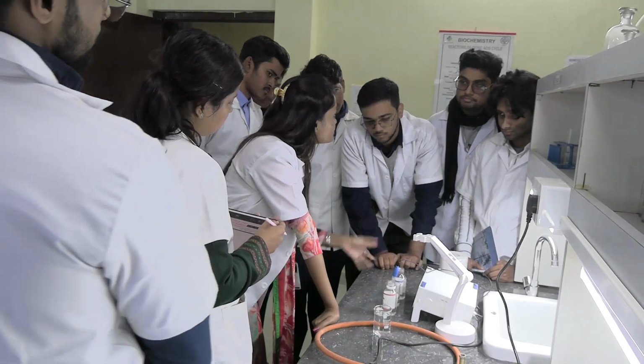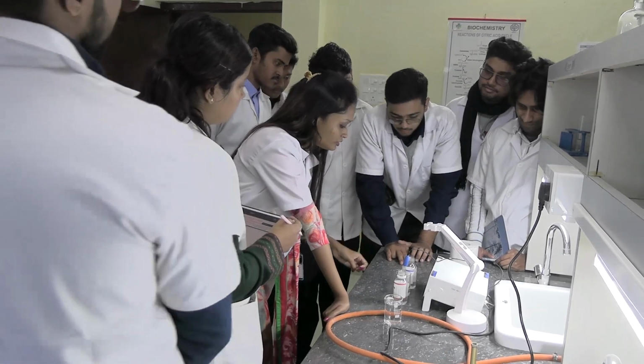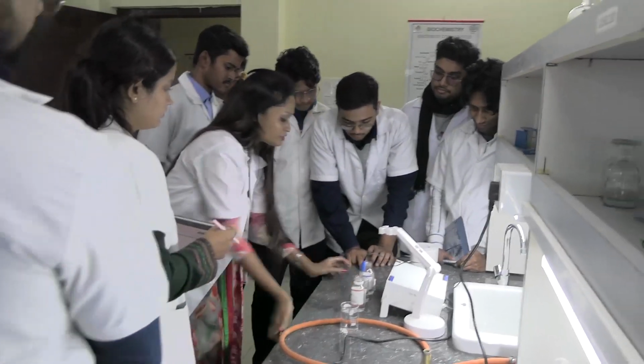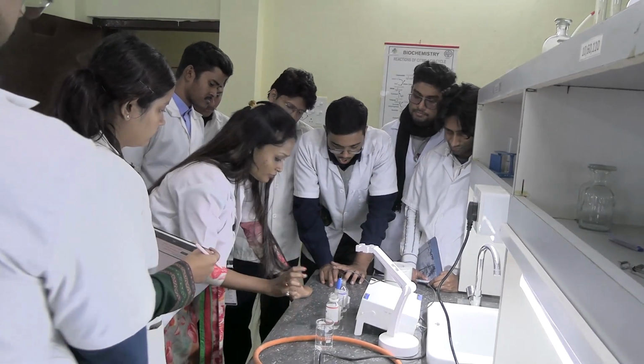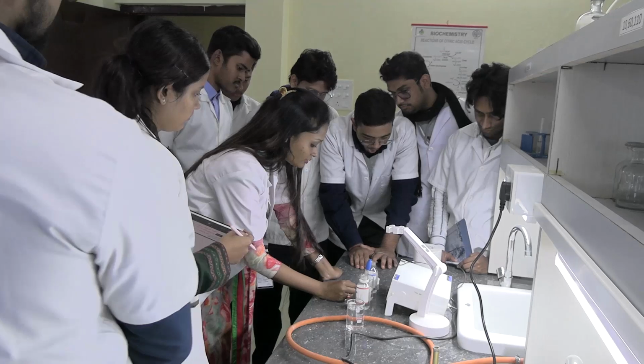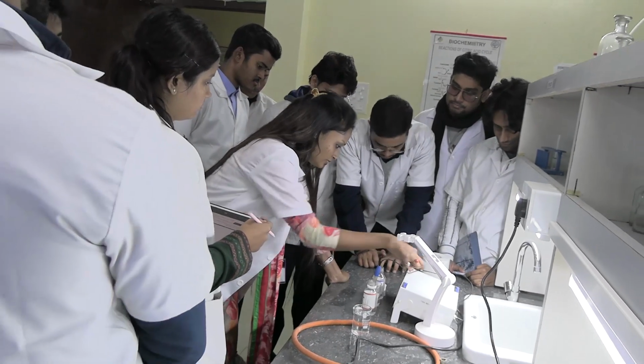The function of a buffer is to set and maintain the pH. That's why we first set the meter with these two buffers, to avoid error in the pH of this solution.